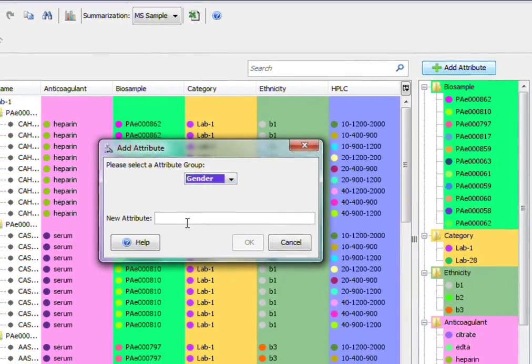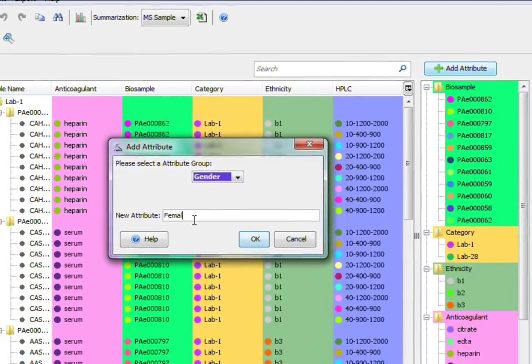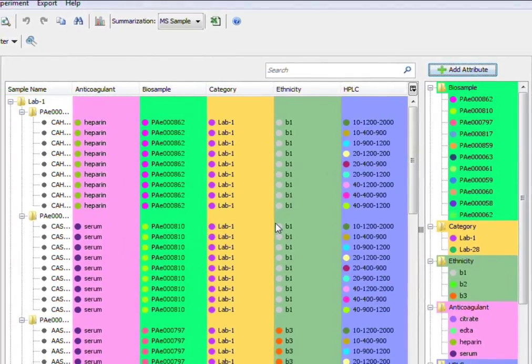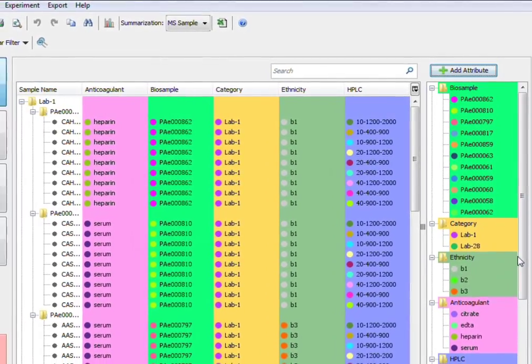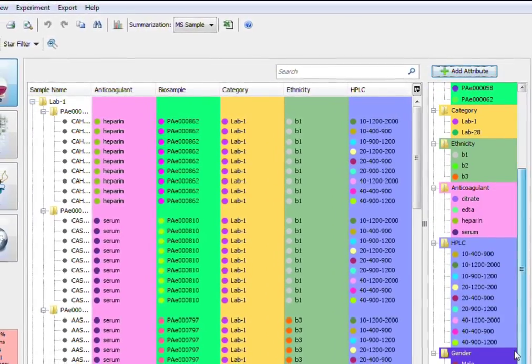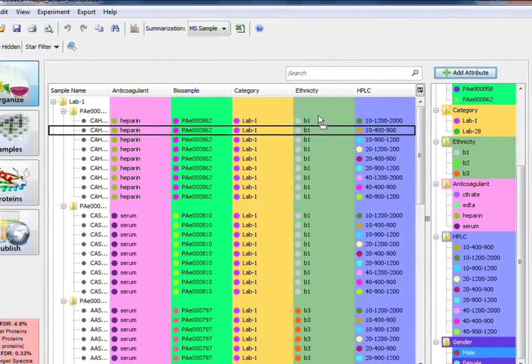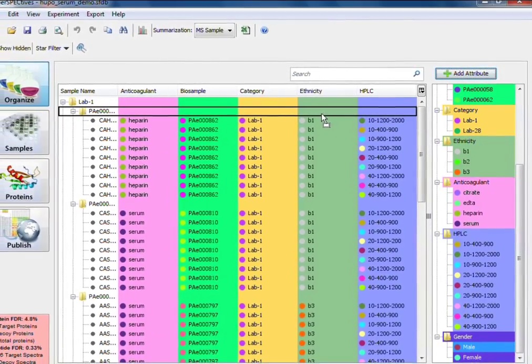Categorize your experiment by custom attributes such as ethnicity, gender, and anticoagulant, and apply the attributes to multiple groups at once.